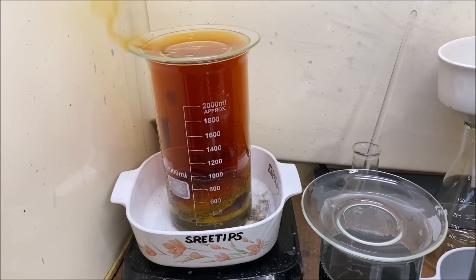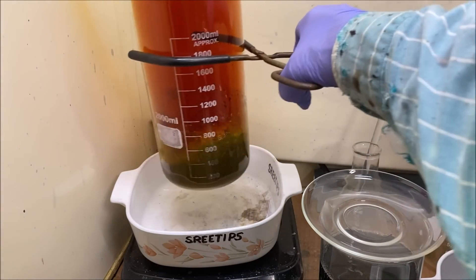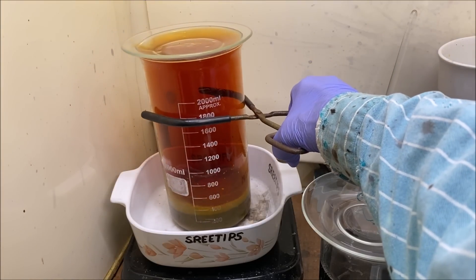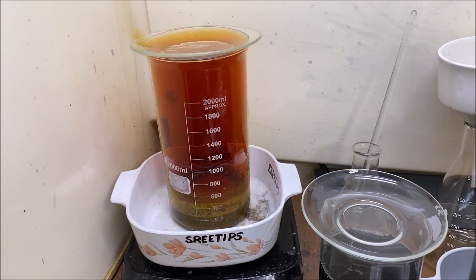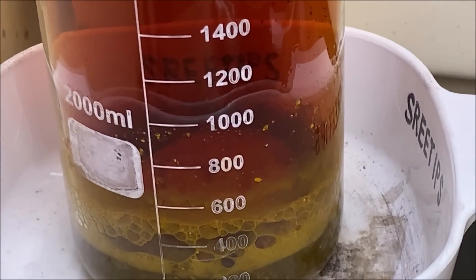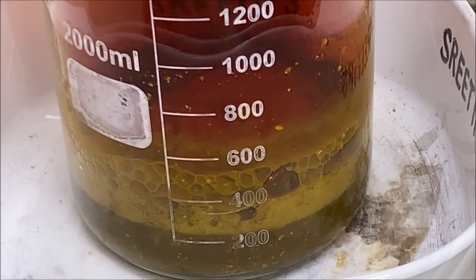Welcome back to part three of the silver cell anode filters refining series of videos. This is our DMG precipitate — it had some metallic silver in with it.